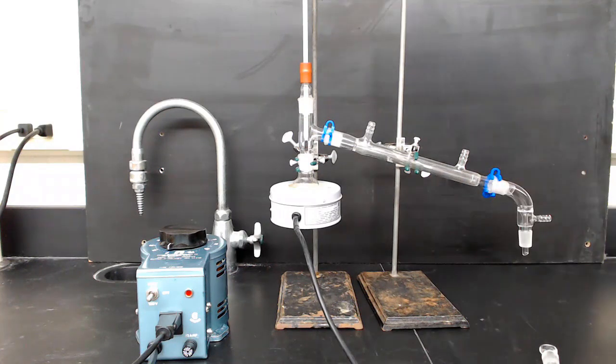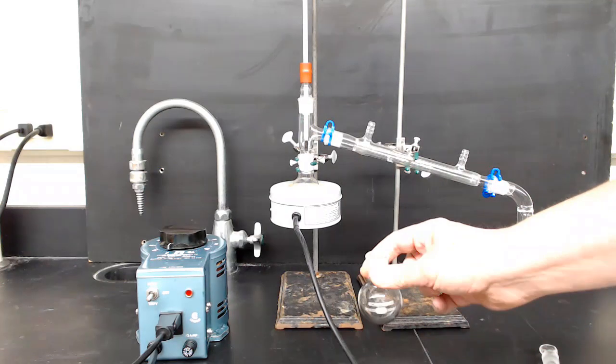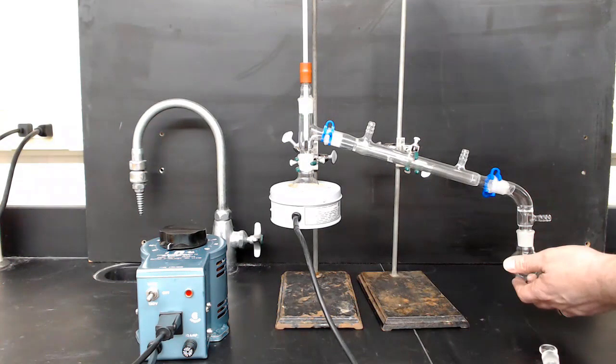Next, we'll need a flask to catch the distillate. This could be just about anything, but today we're going to be using a round-bottom flask. So attach that to the apparatus, and again secure with a Keck clamp.